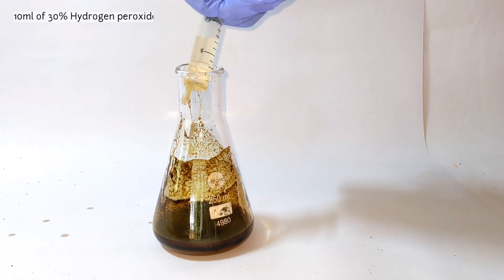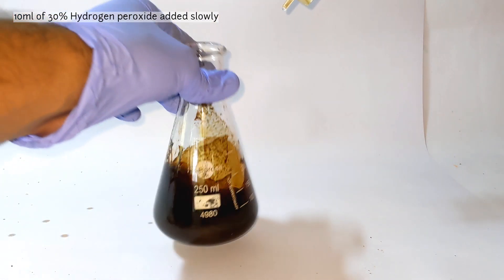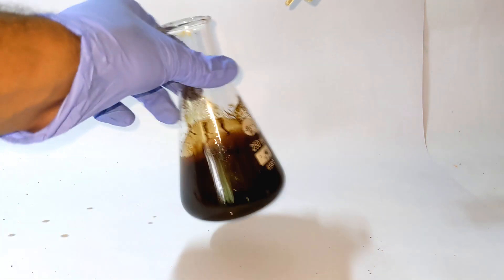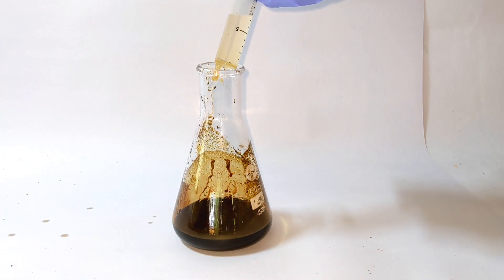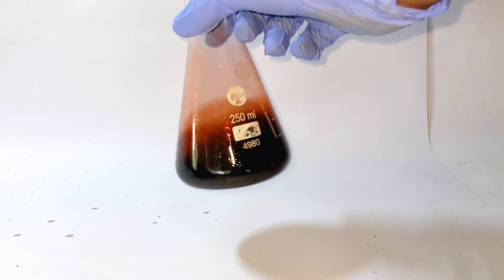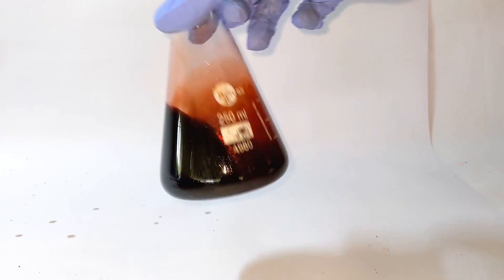Now start adding the 30% hydrogen peroxide solution. This should be added very slowly and the flask should be cooled from time to time because the reaction is exothermic. I kept the flask under running tap water to cool down the rising temperature. You can see the reaction that has taken place until now below.